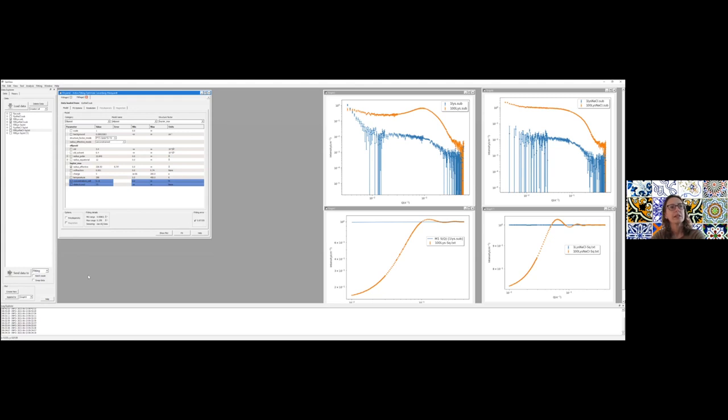And again, here, things like the scattering length density of the protein and the solvent, I gave you the values to try. But these were values that you can estimate and that I calculated using other tools. So I used SASE and I calculated what was the SLD that I expected. I used the PDB and I got this value of 3.4. In reality, for your sample, you don't know precisely the scattering length density of your protein because you don't know the structure, you don't know how compact it is or not. So this can vary a lot. You have an idea, but this can vary.